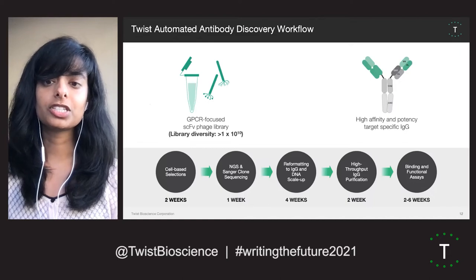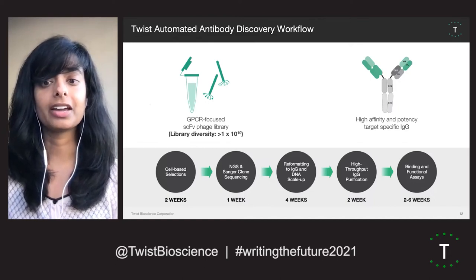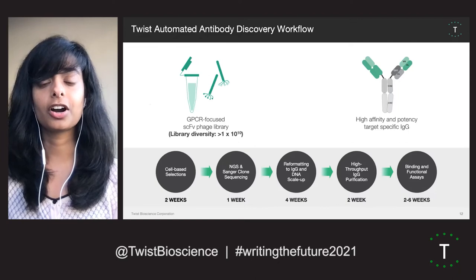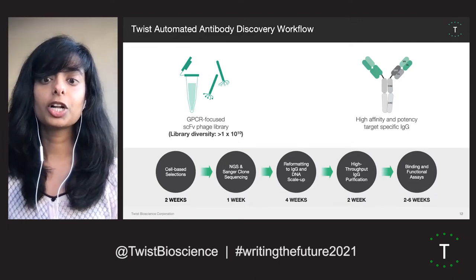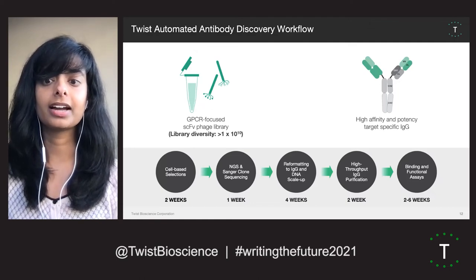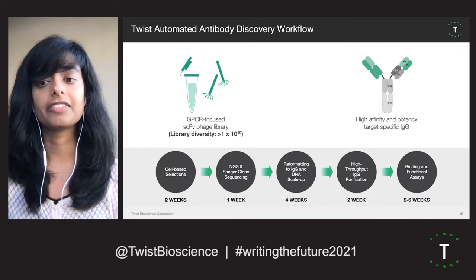Using the Twist GPCR 2.0 library, we used phage display to rapidly pan on cells. Here we panned this GPCR-focused phage display library on a GLP-1R overexpressing Chinese hamster ovary cell line. These GLP-1R expressing CHO cells were used for 5 rounds of phage panning against the GPCR-focused library, through which we identified a panel of hits.